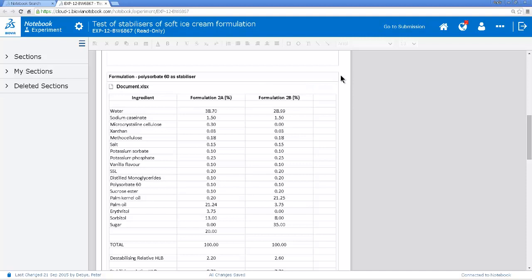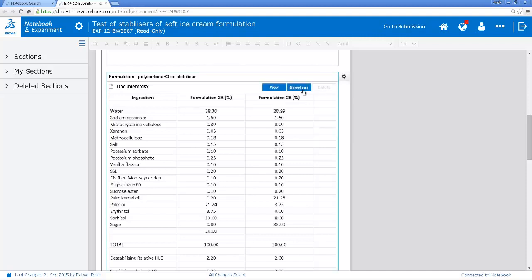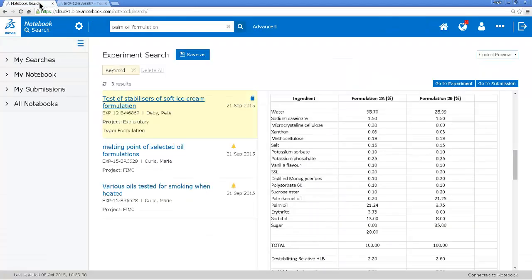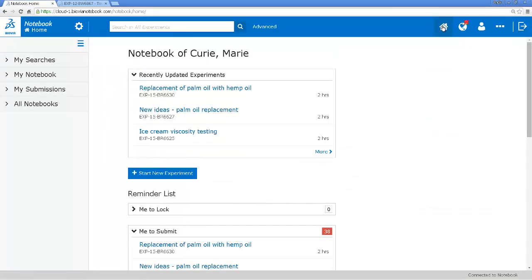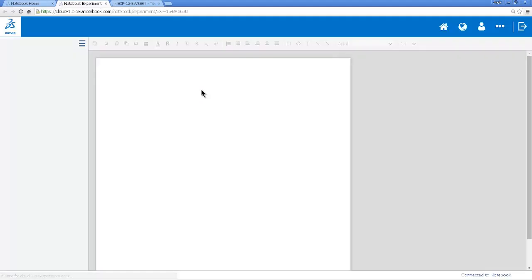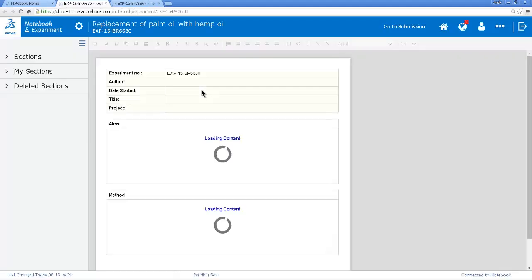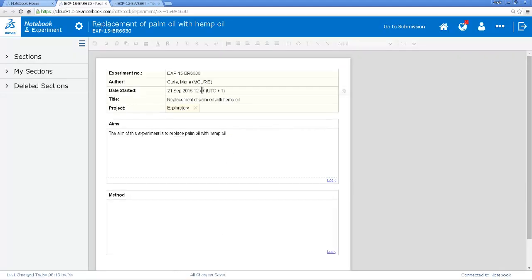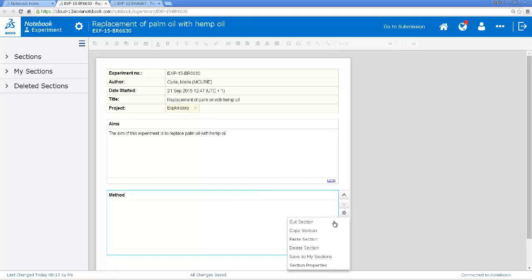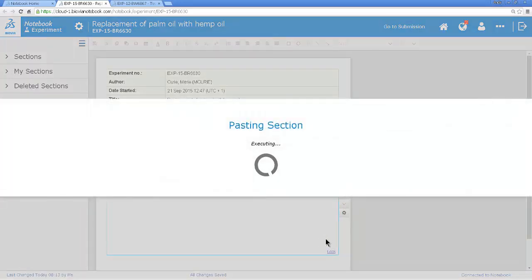So I take this formulation, this recipe, and I copy the section. And then I need to open up the experiment that I'm working on. I'll go back to my home page. I've already started the experiment. I can paste the formulation into my experiment.